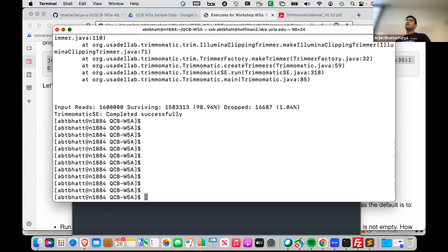So these sorts of conventions are stylistic choices. I've been in labs that make sure raw data, intermediate files, and final data are in separate folders. Right now we're dealing with only four files, so I think it's fine to keep it in data. It's important to keep track of what files are where, and there's some level of linking of files across different processing steps.